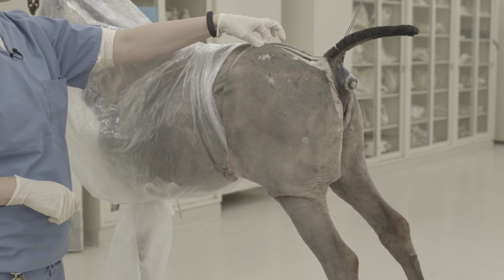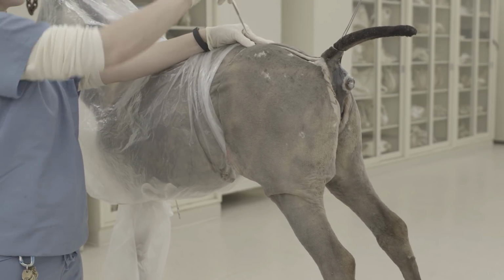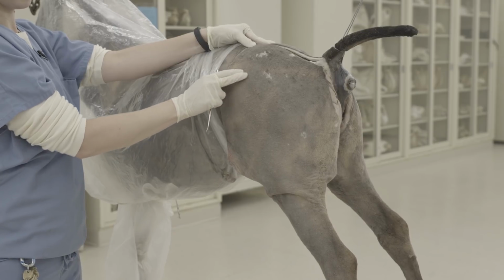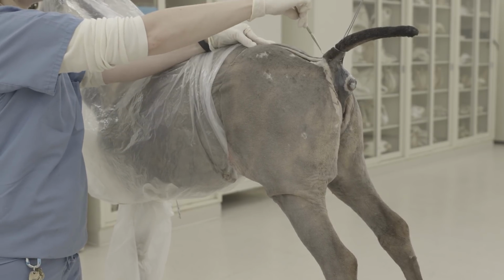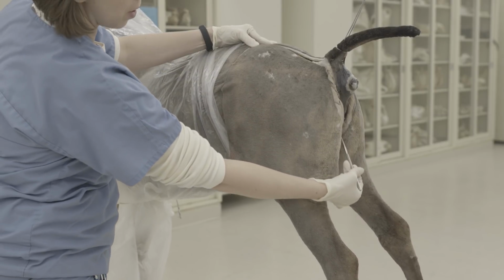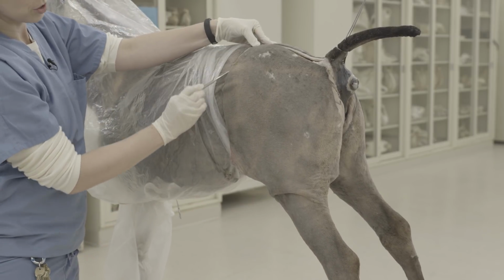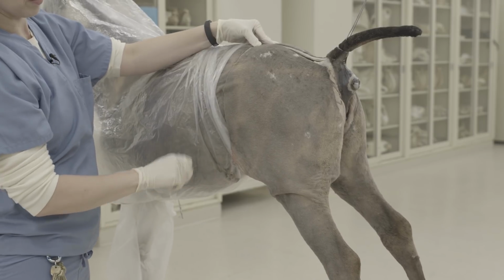So here you're going to start with a mid-dorsal incision, so you're basically going to make an incision from about the level of the tuber coxae, which you can kind of palpate. It'll be the bony bump right here. And you go from about that level down to the base of the tail, around the base of the tail, down the caudal aspect here, and then you're also going to make a vertical incision down the front side, so the cranial edge of your thigh muscles here.